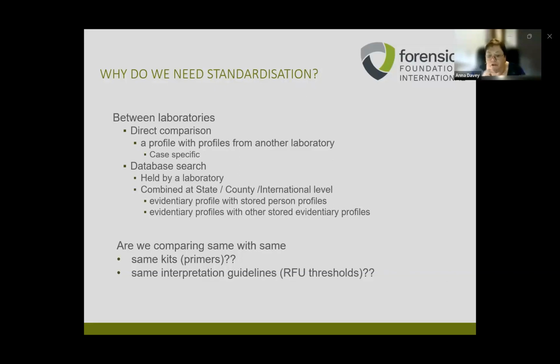We want to ensure two things. We need to ensure that when the material is sent to be uploaded onto the database, it is in an acceptable form according to the standardized guidelines for acceptance onto the database. And you also need to ensure that the way in which the searching is undertaken, the searching algorithms, use the standard searching.